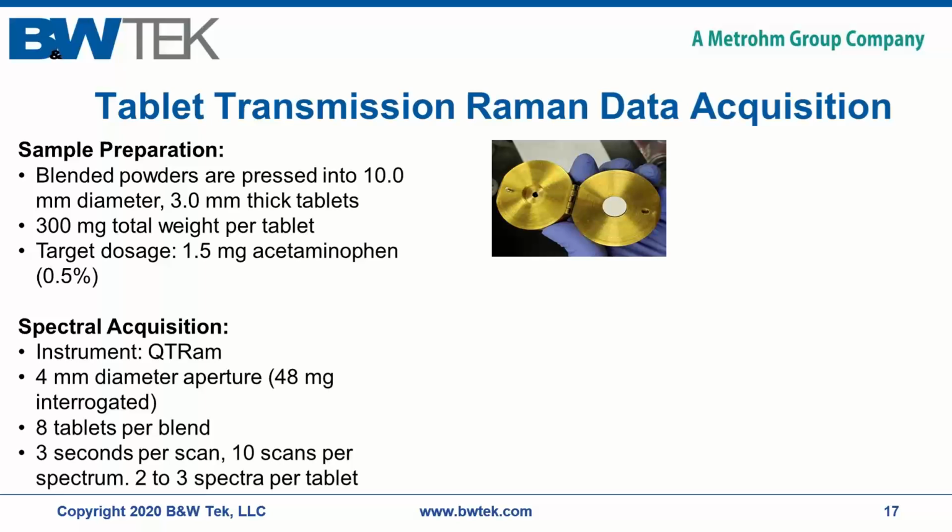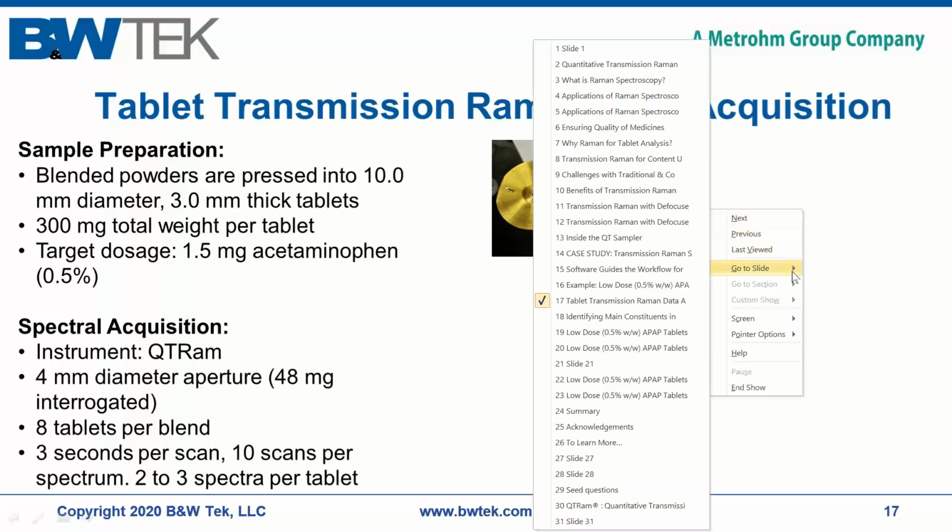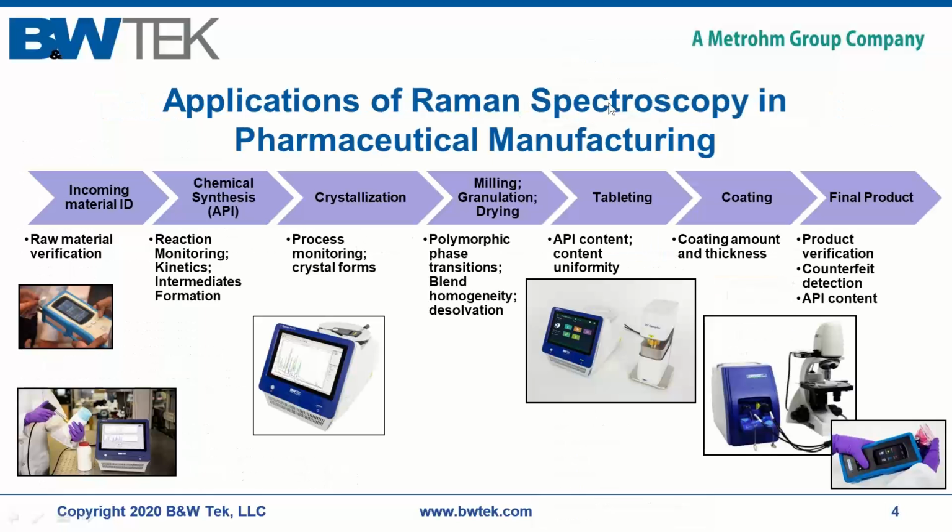Great, and you've just slightly touched on that. Our next question was what other solid dosage forms can be determined? Powders, premixes. These were the questions that one of the listeners was asking. So I don't know if you want to just expand a little bit more, or do you think that was covered? Yeah, they can be measured here. Again, depending on the extent of requiring measurement there versus on the solid dosage form, it may be advisable to actually have a system where you're using a fiber optic probe just for those, giving you more versatility of the different sample forms that you're measuring.